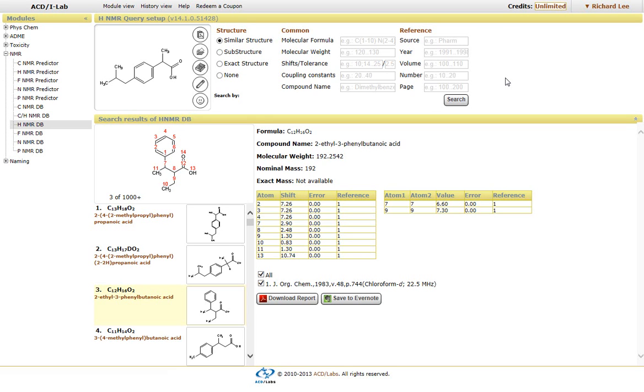So again, this was just a short video on how to use the NMR predictors found within the ACD Labs iLab interface.